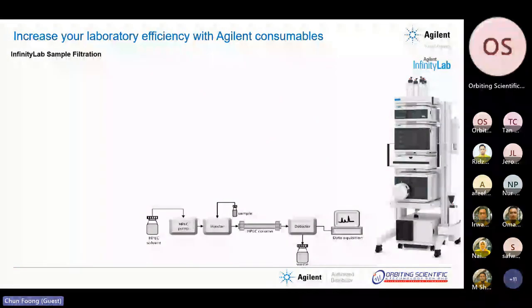So the next is actually about the sample. Yeah, I understand from Puan Naim and also Mr. Zailani previously that they will receive the samples from you all. So the sample is required to be filtered before we inject it into the LC system.